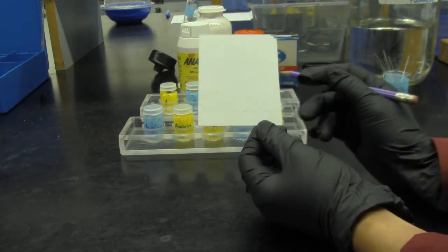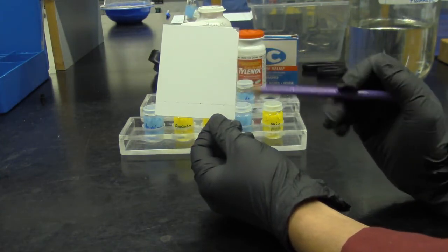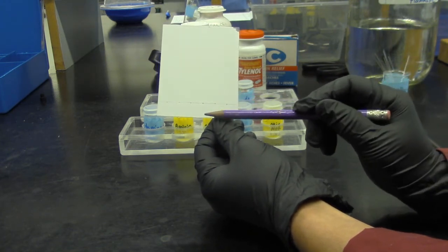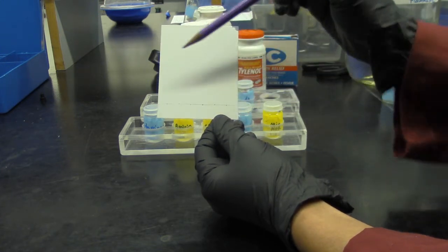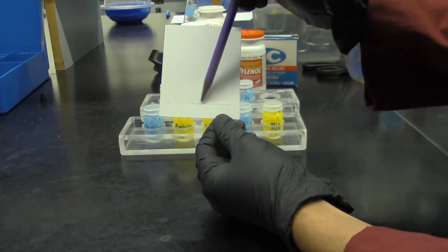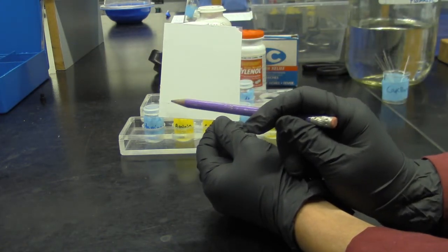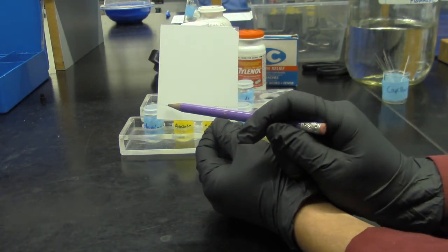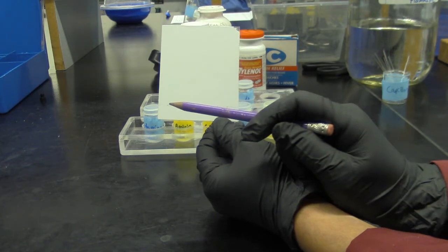Before you spot the TLC plate with all the standards and unknowns, you have to prepare the TLC plate first. First, you draw a line about 1 centimeter above the bottom of the plate, with a pencil. Here I drew a line using a ruler, across the plate, and I put a little tick mark with a pencil. That's where all the standards and the unknowns will be spotted. I have them equally spaced.